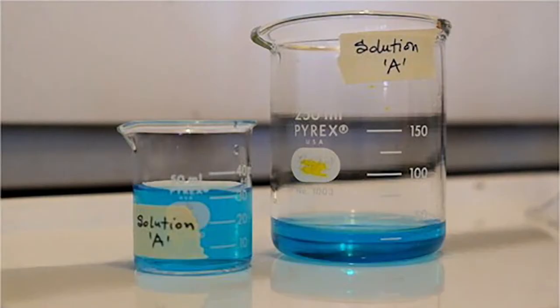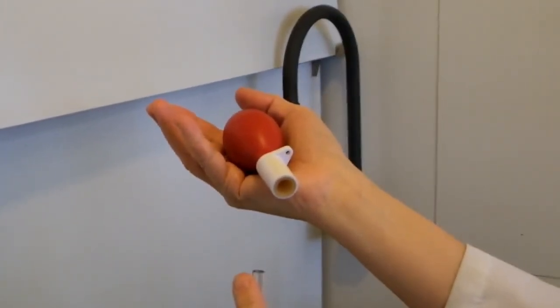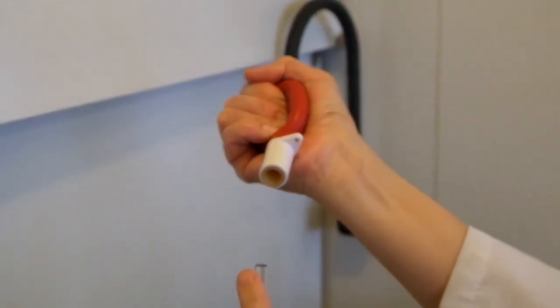Here we have two beakers which contain the same volume of solution A. Compare the depth of the solution between the 50 mL beaker and the 250 mL beaker. The solution in the 50 mL beaker has more depth, and it will be easier to pipette the solution out of this beaker. To fill a pipette for acclimatization, use a rubber bulb to pull up the solution.